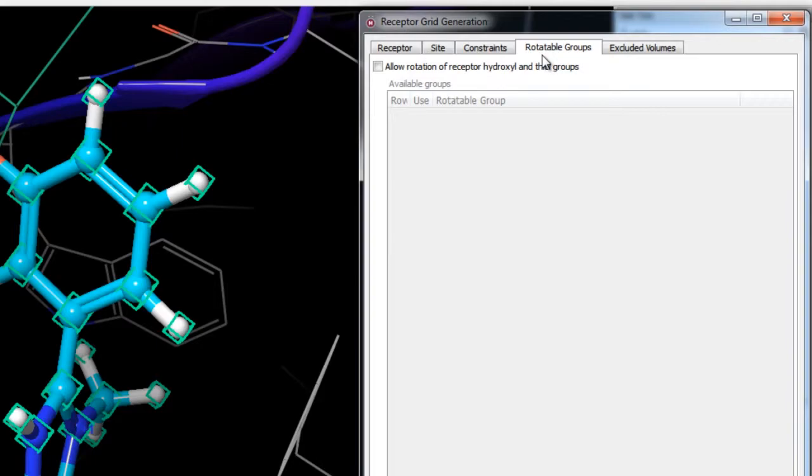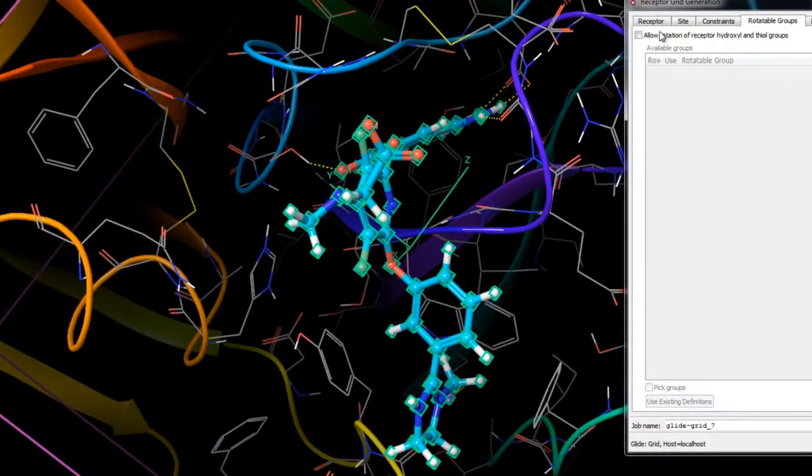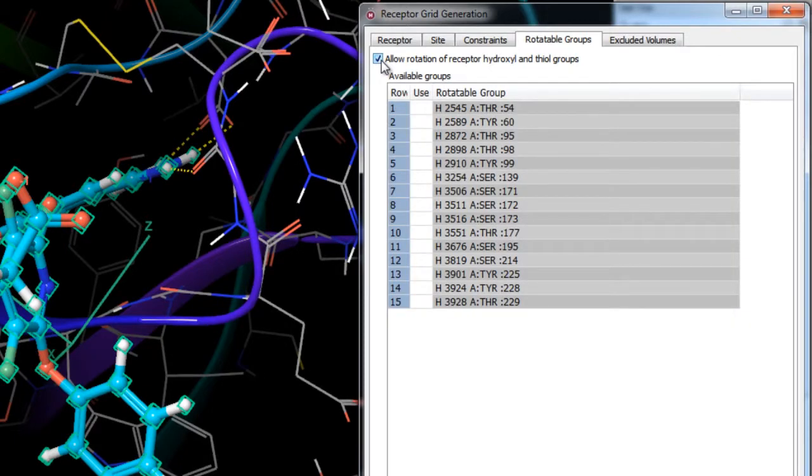The hydroxyl groups in residues such as serine, threonine, and tyrosine, and the thiol group in cysteine, can adopt different orientations with different ligands. In the rotatable groups tab, we have the option to allow such groups to adopt different orientations when ligands are docked to produce the most favorable interaction. Simply turn on the checkbox to allow rotation of these groups.